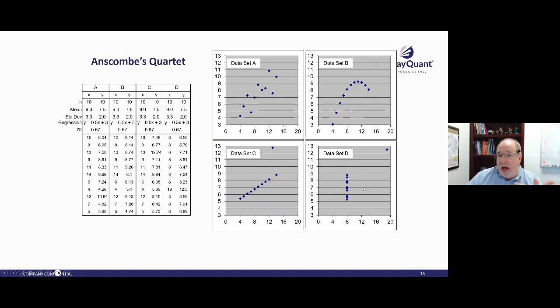Now, if you were to plot the residuals for all of these, this would all look random from here, and there'd be something very systematic about the residuals for these here, especially this one. You'd see something increasing, you'd see a blip here and here, or as you go out along that line. So the advent of residual plotting that we all do nowadays would help with this, but you still have to look at that data. If you look at this data, you're going to say, this is not what you expected.